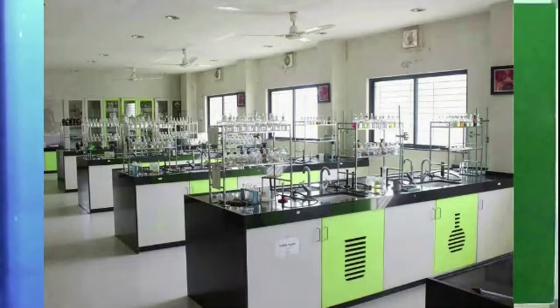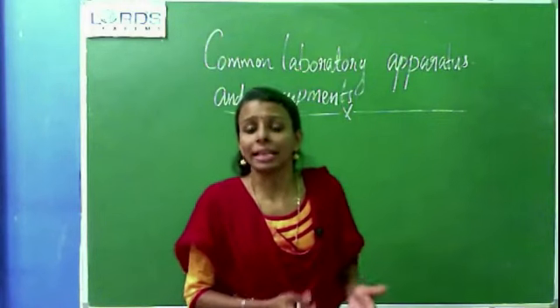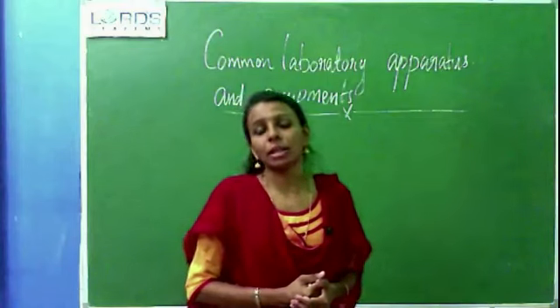Just look at the picture. The picture shows the chemistry laboratory. We can see varieties of apparatus here. The majority of these apparatus are made up of glass. A number of facilities are available in this chemistry laboratory.